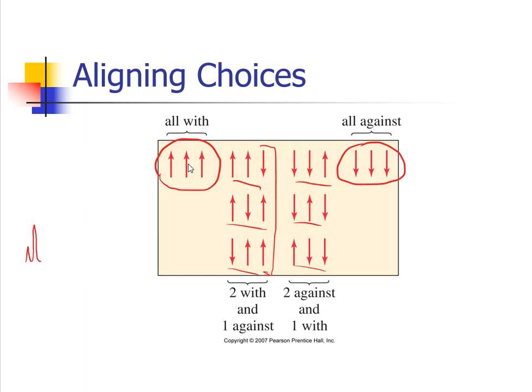Then, in this case, 2 of them are against. Well, that means if I'm looking at one major signal, if 2 of them are against that signal, it might lower the ppm value. But we still have 3 possibilities to get that done. So because of that, we typically see another split in that shift that will be about the same height as the previous one, right?